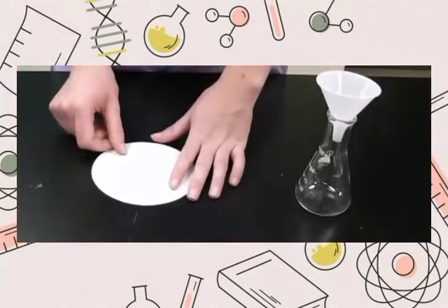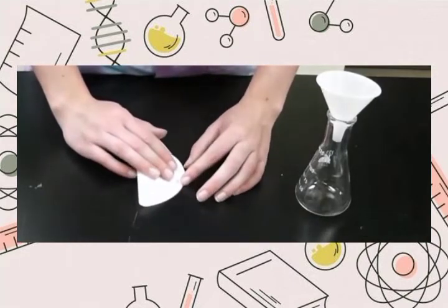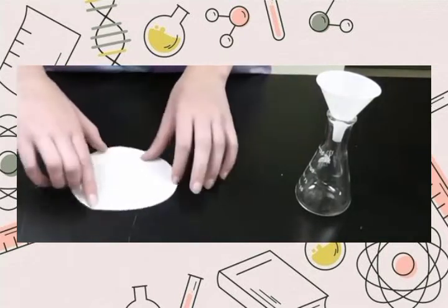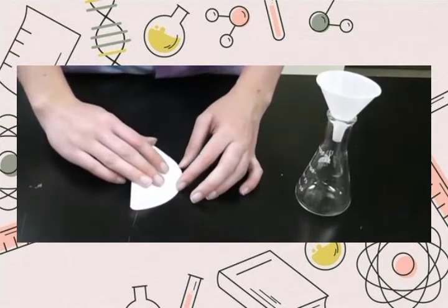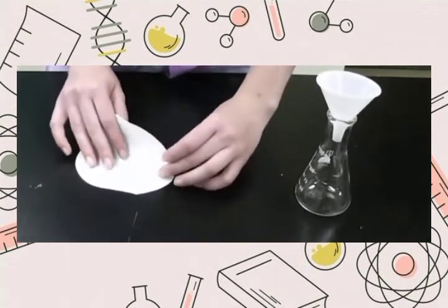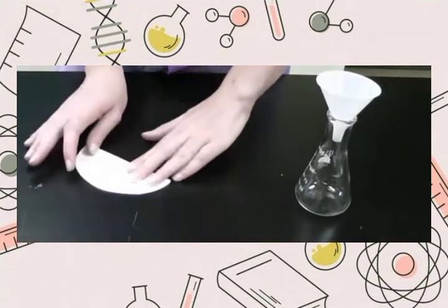So we proceed to folding a filter paper. The first step, fold your filter paper in half, then open it and rotate it 90 degrees and fold it in half again. Open it and rotate it 45 degrees and fold it again halfway between the existing folds. Open it again, rotate 90 degrees and fold it once more. Your filter paper should now be divided into 8.